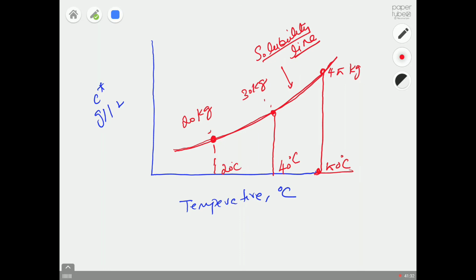If you apply for a job like a crystallization scientist, then they will ask you a lot of questions about how you measure solubility, what the concept behind solubility is, what you think about supersaturation, and many things. What are the different techniques available to get the experimental data on solubility? So that's why it's really important.